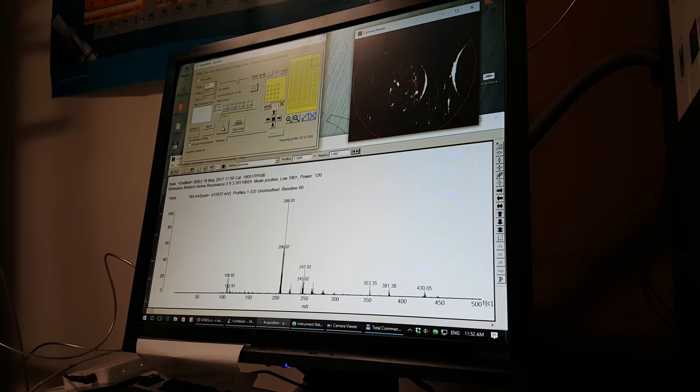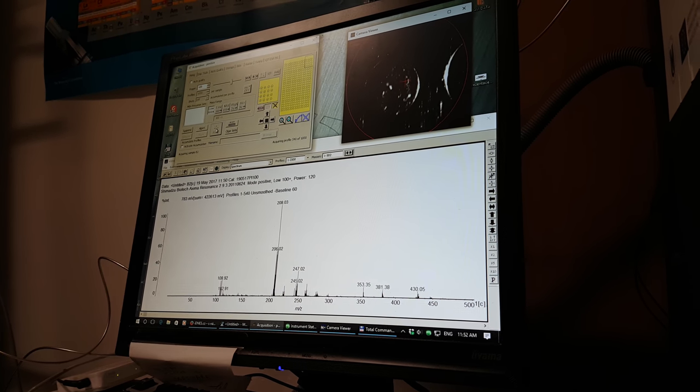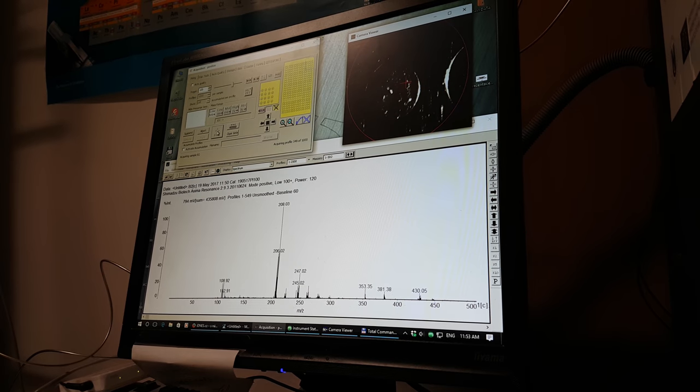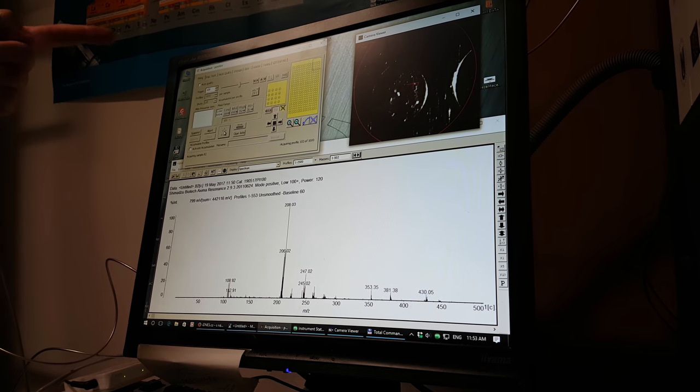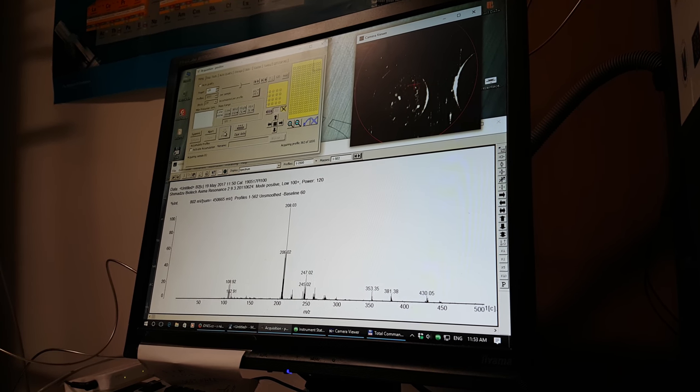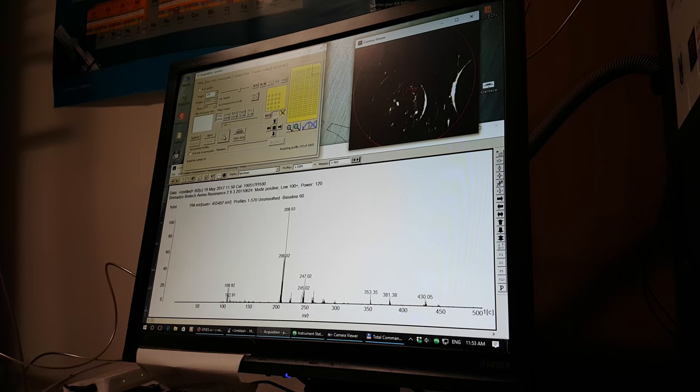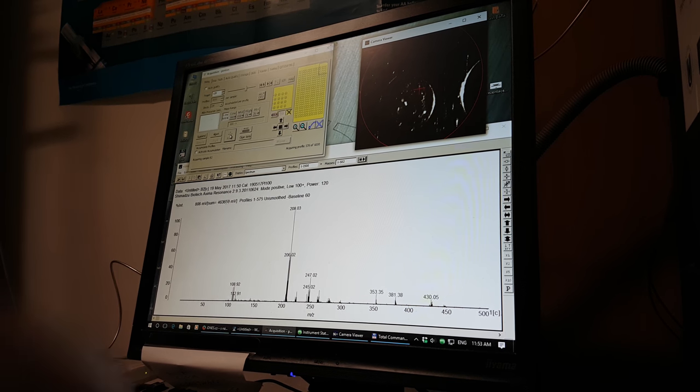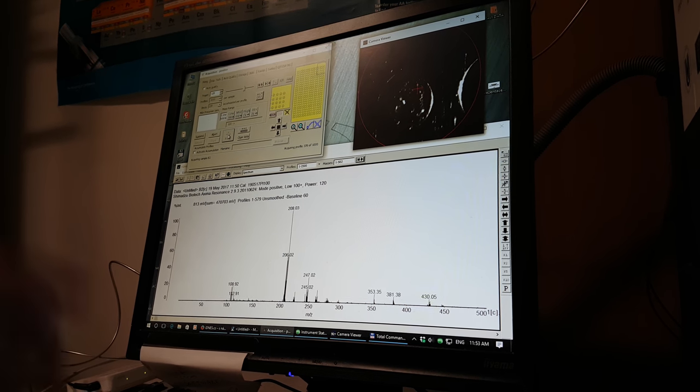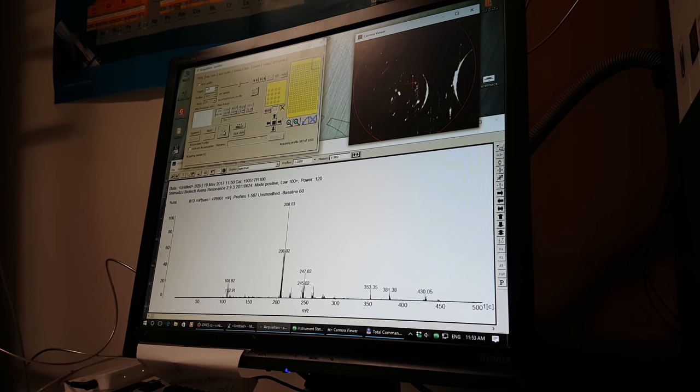You did a background measurement earlier, right? Yes, I have. I can also measure an empty sample.